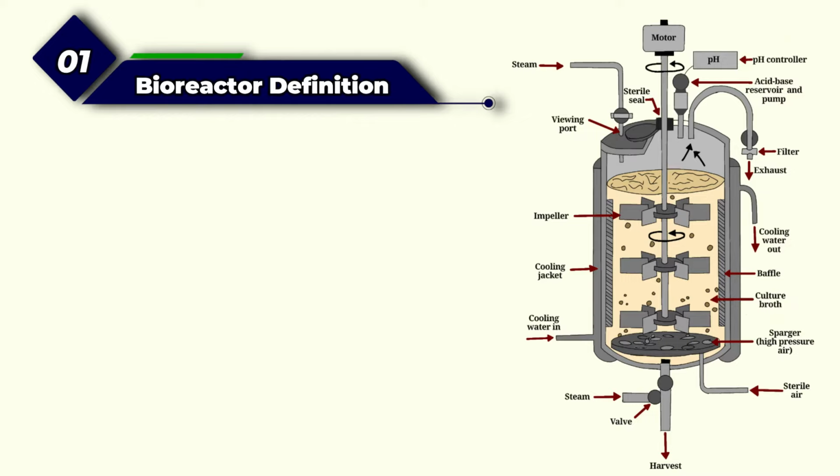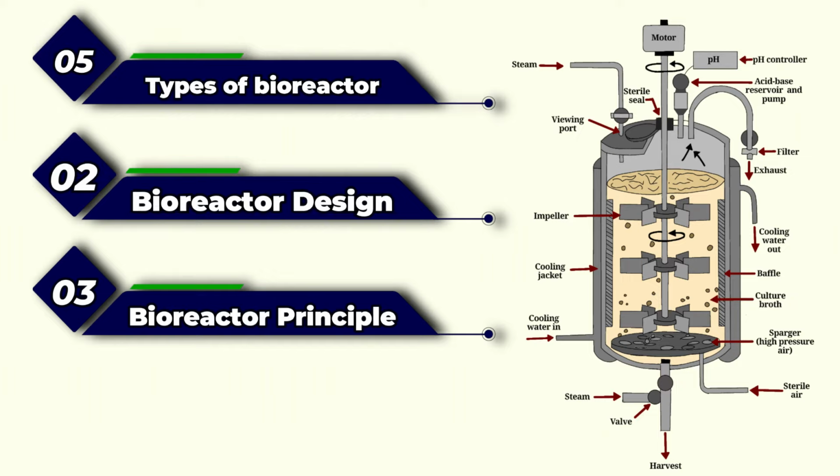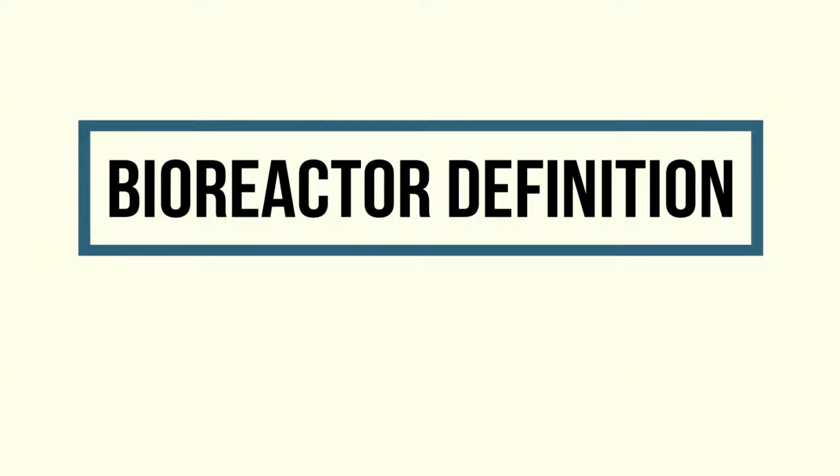In this topic, we have the definition of bioreactor, its design, the principle behind it, parts of the bioreactor and their function, the different types of bioreactors, applications of bioreactors, and lastly, limitations of bioreactors. Let's begin with the definition of bioreactors.